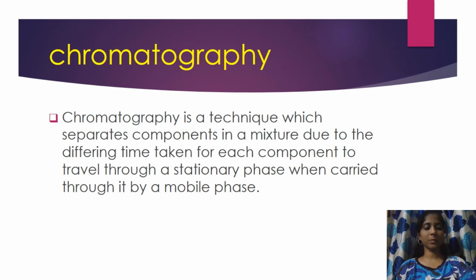What is the principle of HPLC? Depending on the nature of the stationary phase, the separation process can occur in four different modes. The principle of HPLC is based on the Van Deemter equation, which relates the efficiency of the chromatographic column to the particle size of the column, molecular diffusion, and the thickness of the stationary phase.